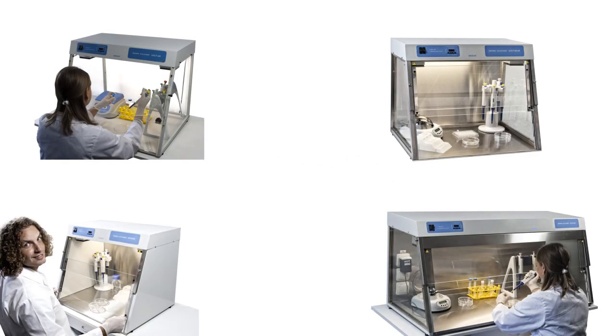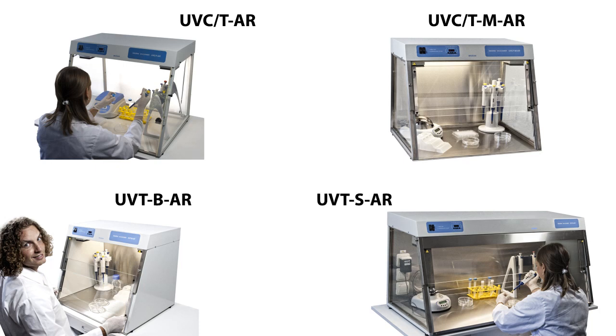Biosync presents four UV cabinets for PCR operations: UVCT-AR, UVCT-MAR, UVT-BAR and UVTSAR.